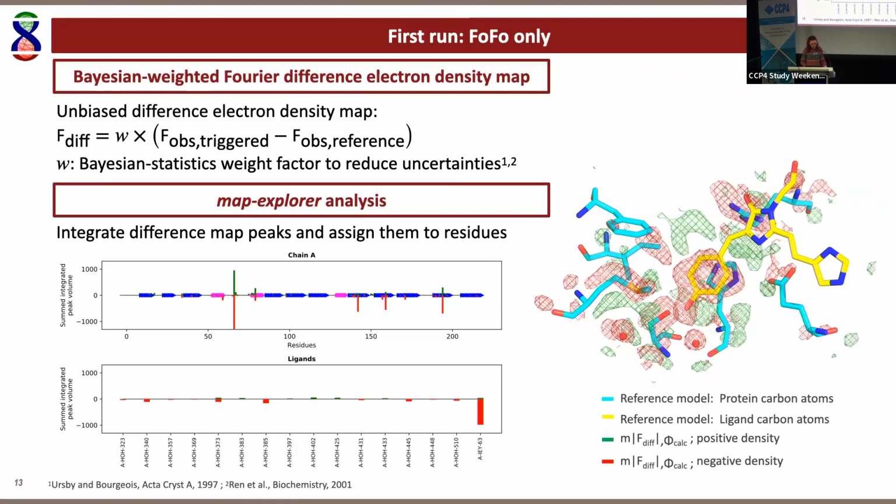So what you get out of this is different files and a figure, which shows the amino acid sequence here on the x-axis. You get some annotations of secondary structures, such as beta sheets and alpha helices. And on top of that, you see the peak integrations of your difference maps, so positive peaks and negative peaks on your specific locations.